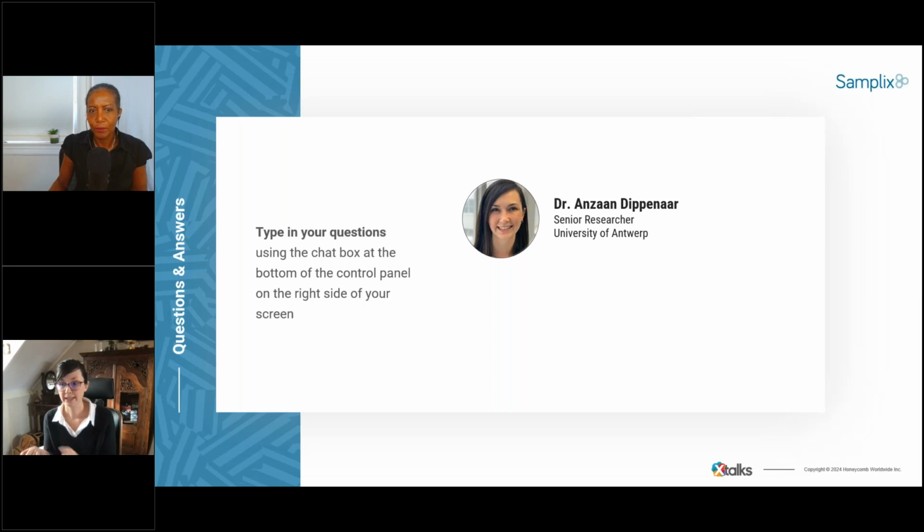And then one other thing that I mentioned in the next steps is the read until or selective sequencing function that hasn't been really explored and is fairly new, but that we think will aid in taking this to the next step and enabling it in clinical samples.